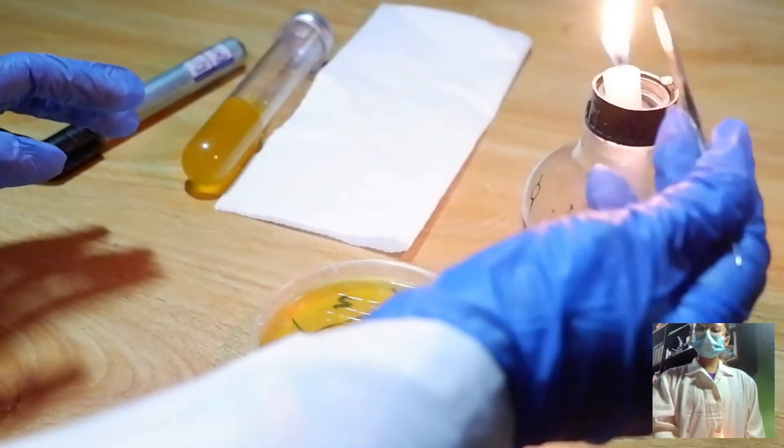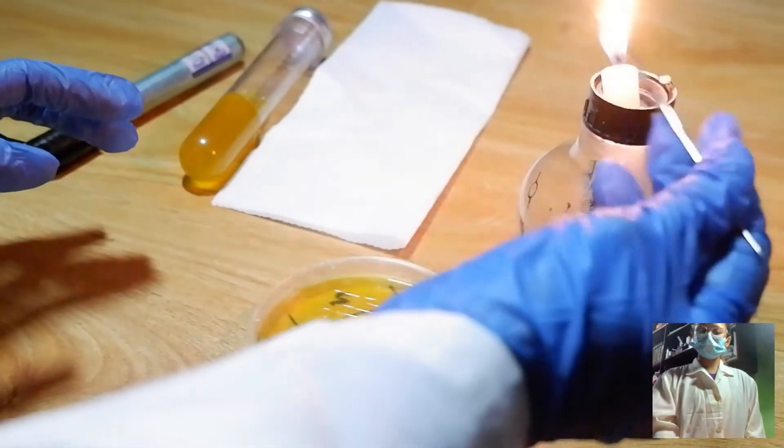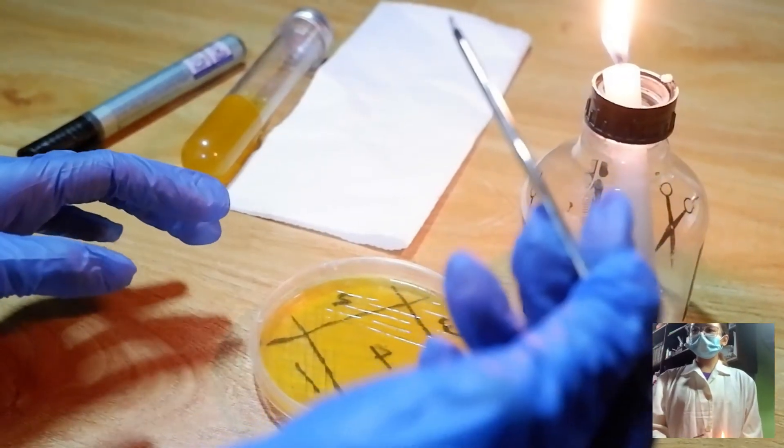Now, let it cool down for 5 to 10 seconds. We will have to sterilize the loop again, so flame it here, and allow it to cool for 5 to 10 seconds again.